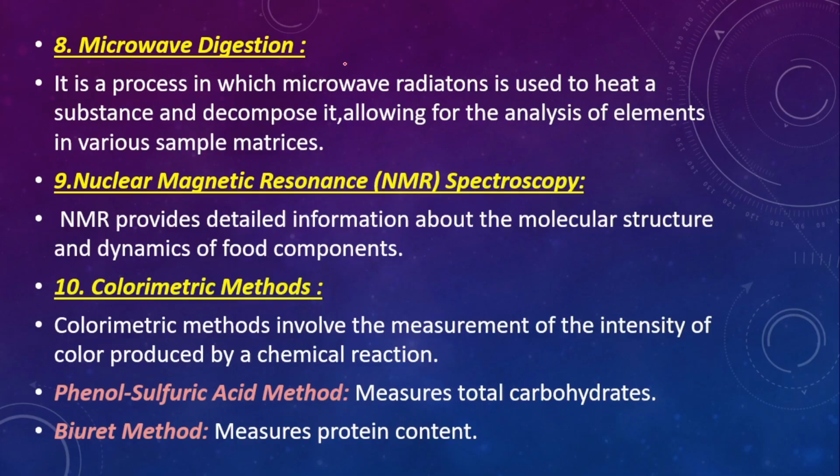It is commonly applied in testing for contaminants like heavy metals, for example lead and cadmium, and verifying nutrient content. Microwave digestion offers faster, more efficient sample preparation compared to traditional methods. It is essential for accurate and reliable elemental analysis in food safety and quality assurance.